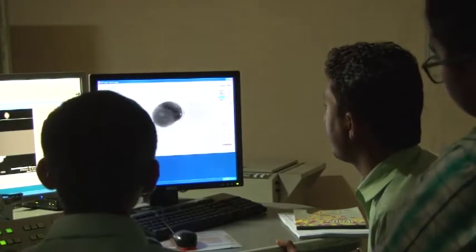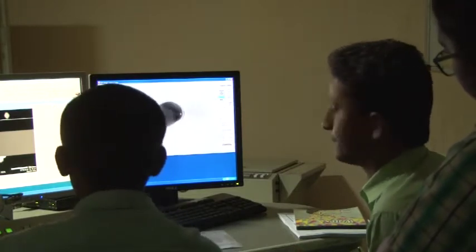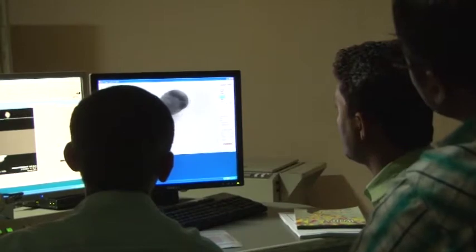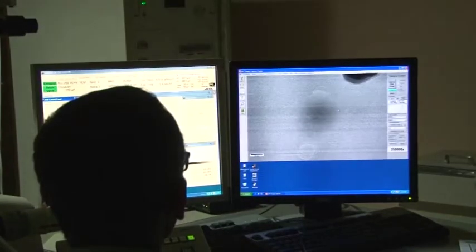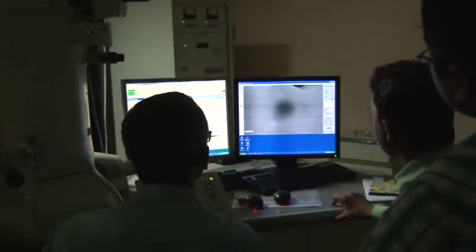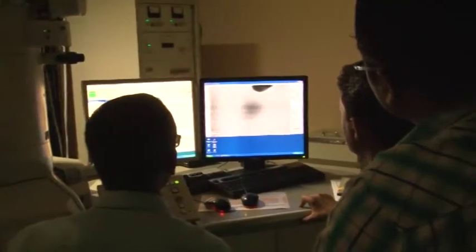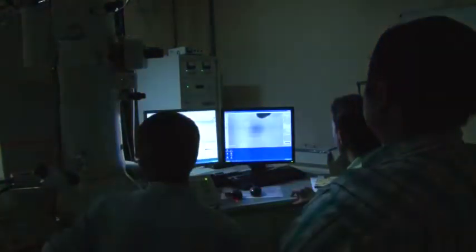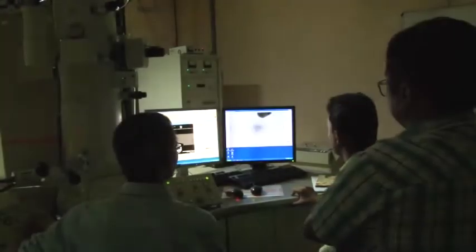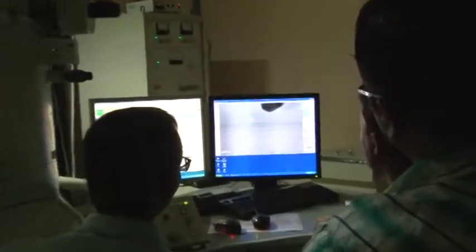Now, when does objective astigmatism appear? If, let us say, more than that, I am thinking that this whole method is very useful. Anyway, it doesn't matter. The sample had been exposed too much, so it will take a little time. Now I have reduced the intensity a little, and then it started behaving properly.